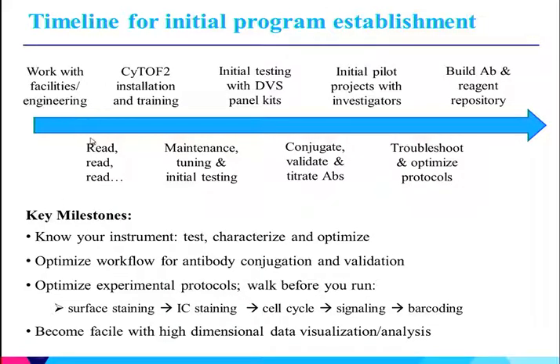So at least in my case, in addition to reading every paper that had the word CyTOF in it, it was also going through a lot of old inorganic chemistry that I hadn't looked at for a long time, and physics, and being able to get all these parts in place so that when the instrument actually arrives, you can hit the ground running. So DVS provides the installation and initial training. And the key after that is really becoming very familiar with the instrument. So this is just doing a lot of maintenance on it, tuning it, taking it apart, putting it together, figuring out how, if you loosen this thing, it's going to affect your signal, and if you break this part, whether it's still going to be usable. And so really it's just becoming really familiar, and through robust testing, characterization, and optimization of your instrument.